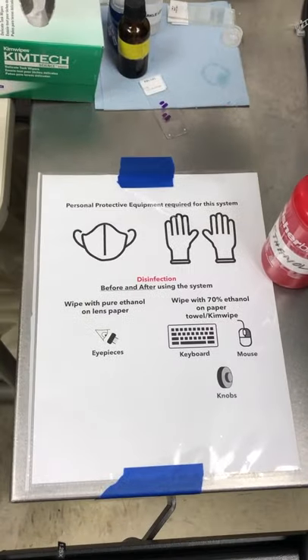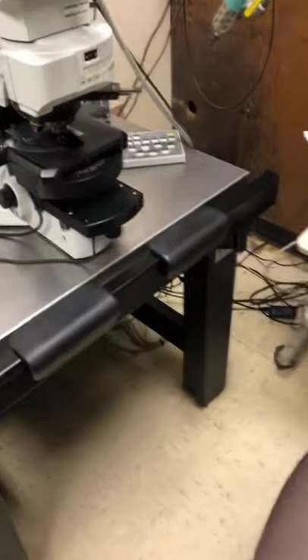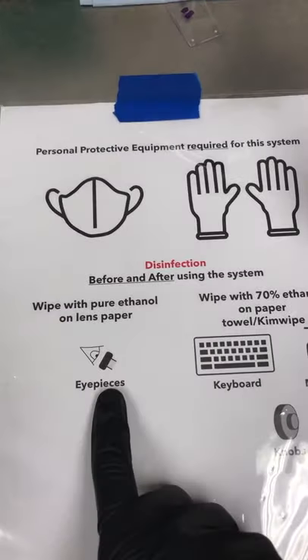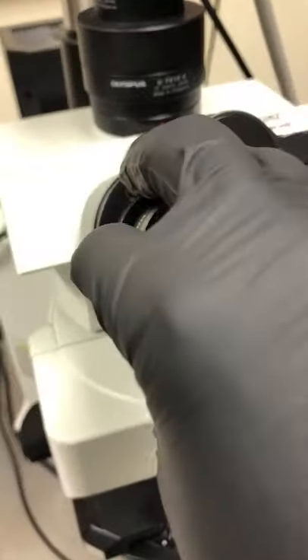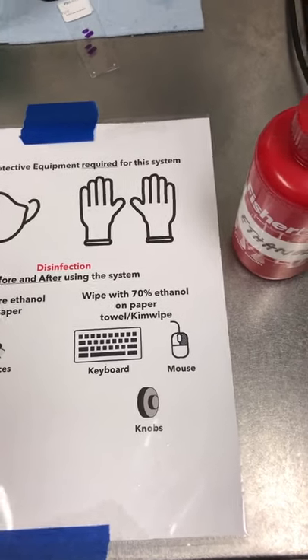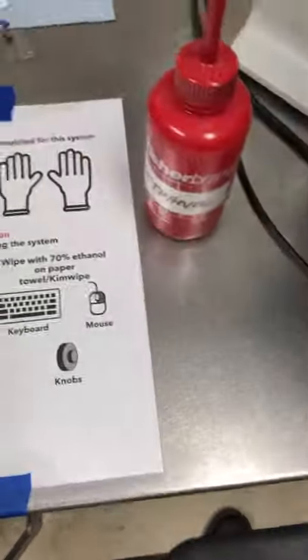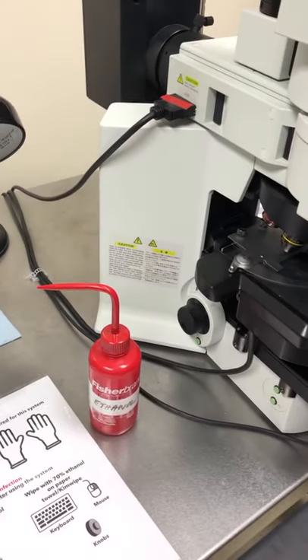Now we need to do disinfection. This is actually hard to do one-handed, so I'm going to show you where I'm going to do it, then stop the video to do it. Take off the dust cover. You need to disinfect the eyepieces with pure ethanol using lens paper — both eyepieces and the region around them. Then disinfect with 70% ethanol on a paper towel or kim wipe: the keyboard, the mouse, and the knobs — basically anything on the microscope you might touch.